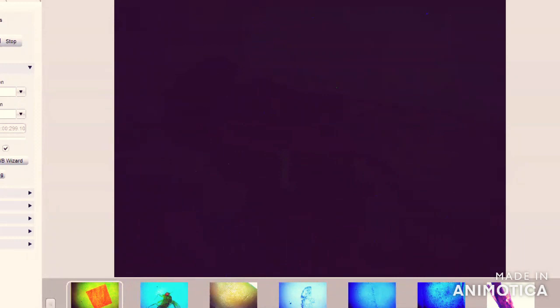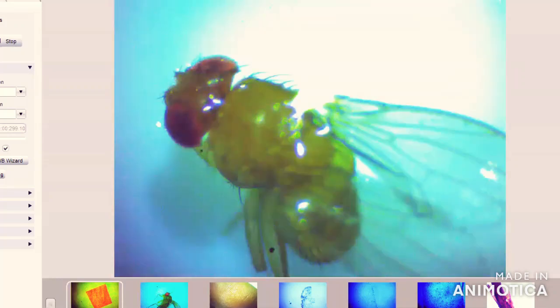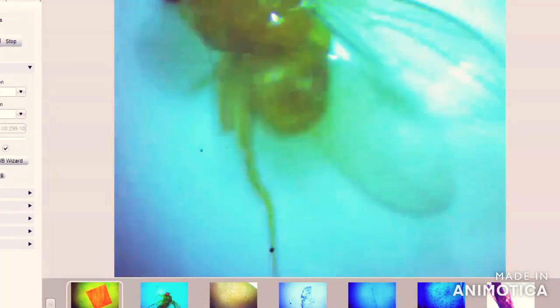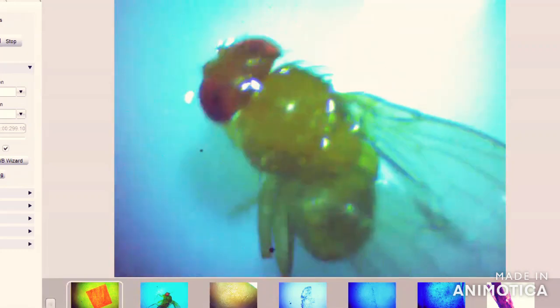We are here to see the Drosophila under the microscope. If I turn on the light, this is the red-eyed Drosophila as you see here, and it has two wings. So it belongs to the order Diptera, di means two. This is one red-eyed Drosophila.